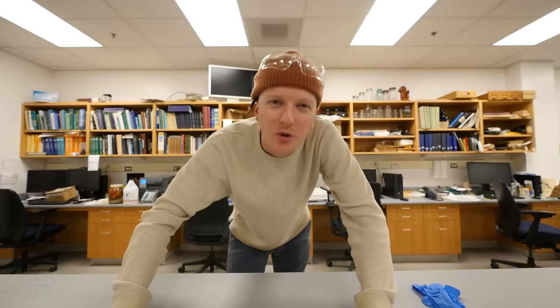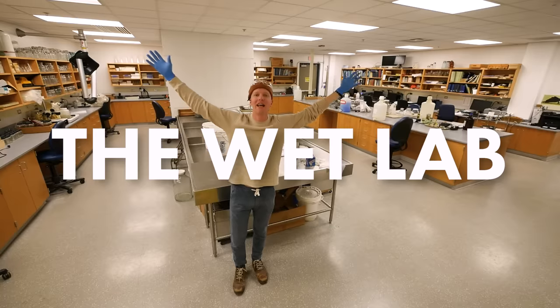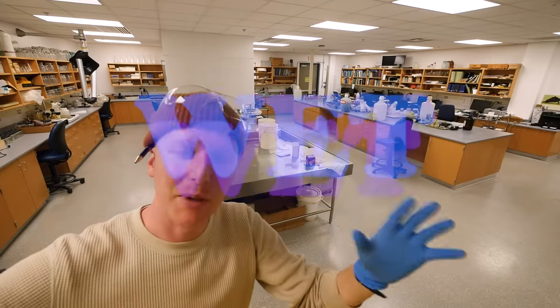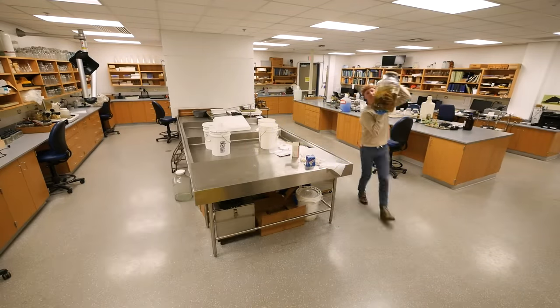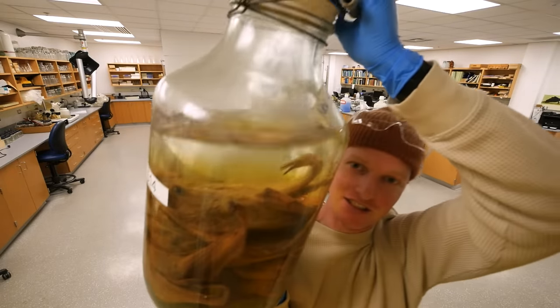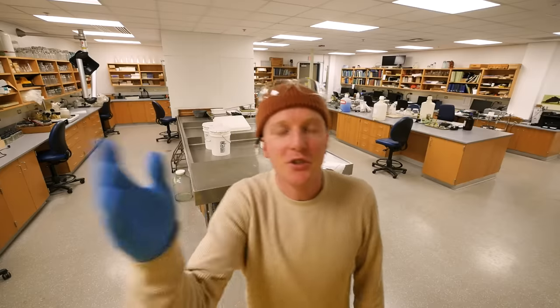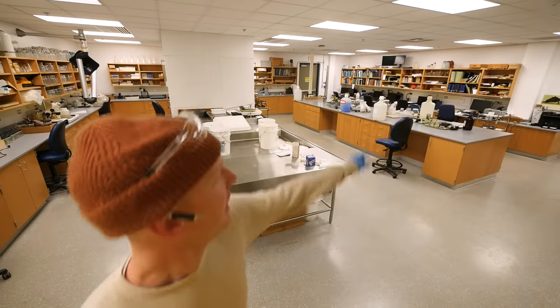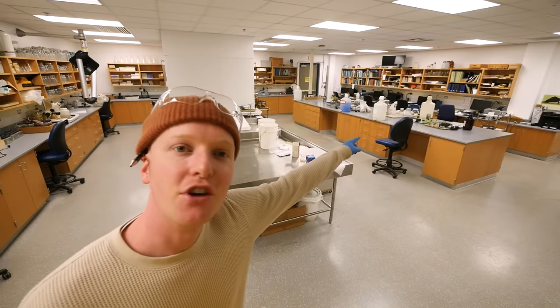Hello my friends, welcome to the wet lab. The wet lab is a pretty big space where you handle wet specimens in the collection — stuff that's stored in ethanol usually. There's a lot more people here normally; any day you can come in you'll see someone processing a lion or packaging a bunch of turtles.